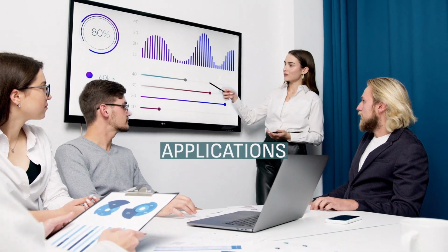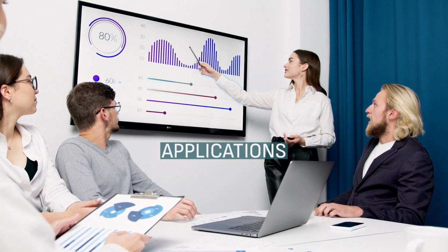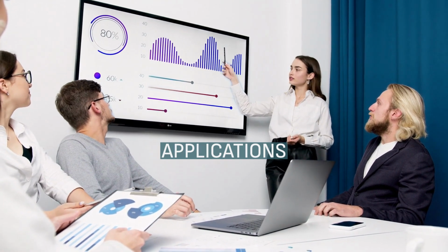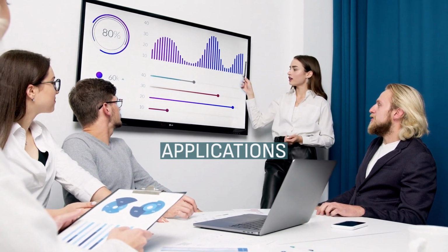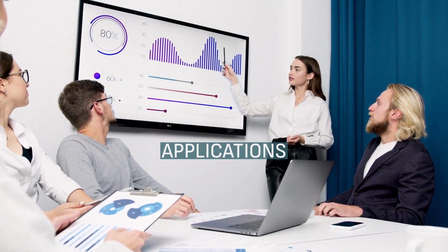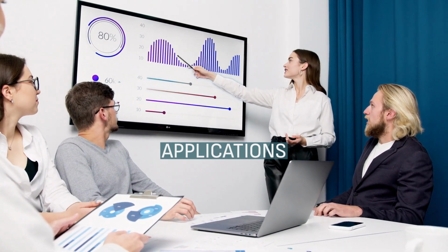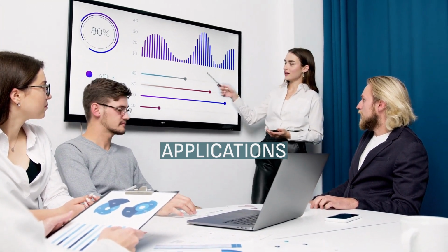Get ready for a captivating exploration as we unravel the layers of applications and their profound significance. Ion beam analysis has found use in a number of variable applications, ranging from biomedical uses to studying ancient artifacts. The popularity of this technique stems from the sensitive data that can be collected without significant distortion to the system on which it is studying.